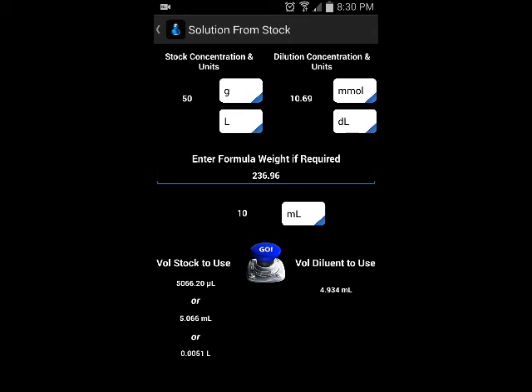Since we wanted to measure in milliliters, it automatically gives us our diluent in milliliters. For your stock, it'll give you different units to choose from — microliters, milliliters, and liters — so you can go with milliliters to keep it simple. Notice we didn't have to do any unit conversions on our own; it was all done behind the scenes. That's something the other apps don't provide.